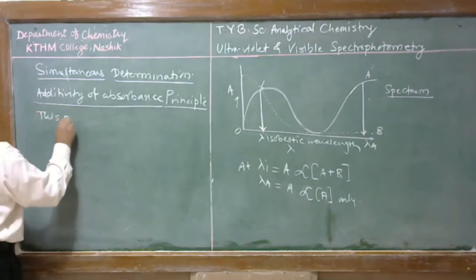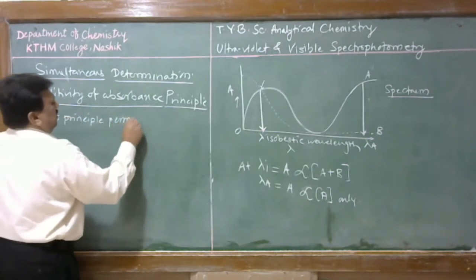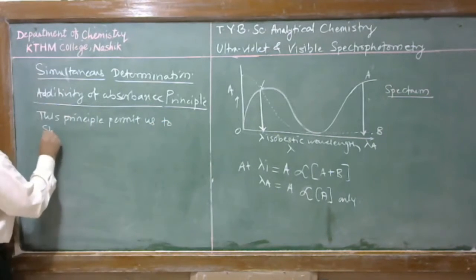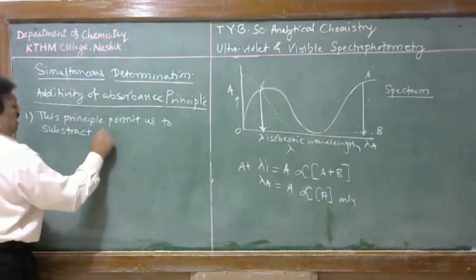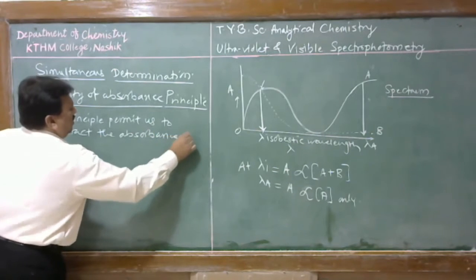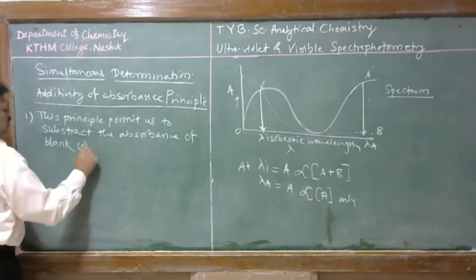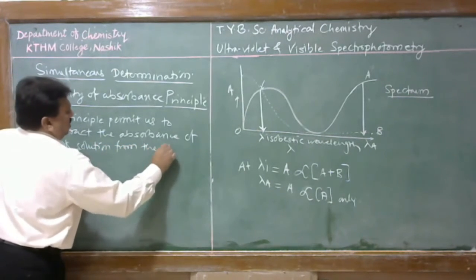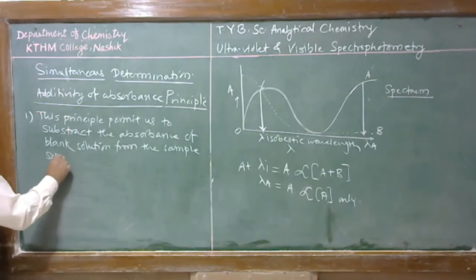This principle permits us to subtract the absorbance of a blank solution from the sample solution.